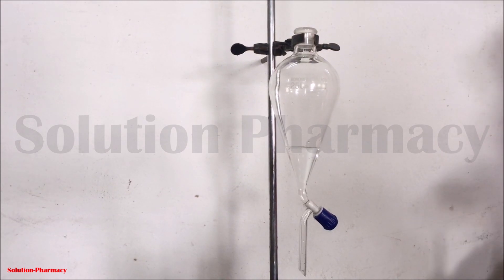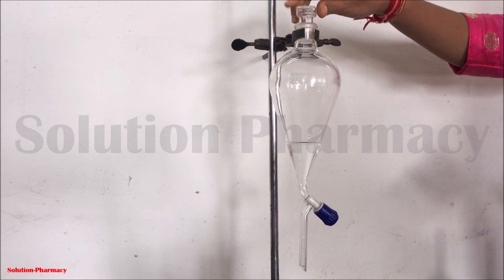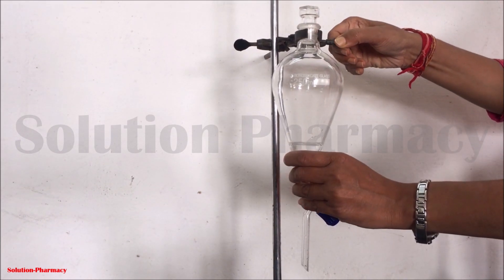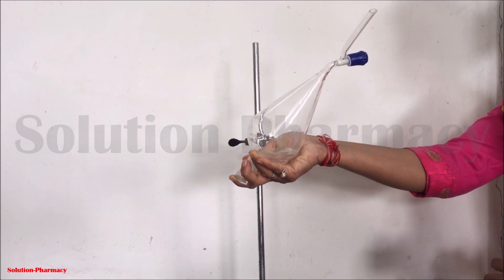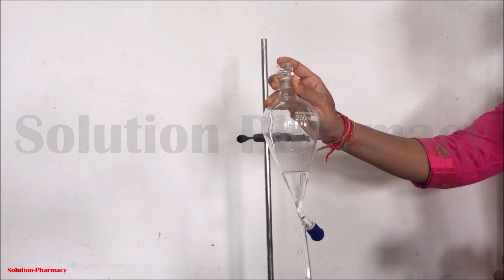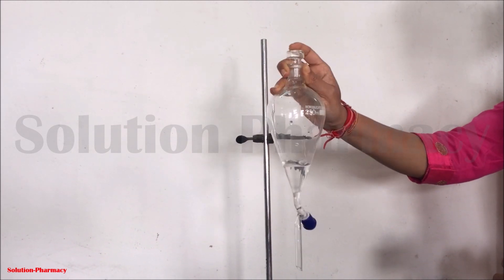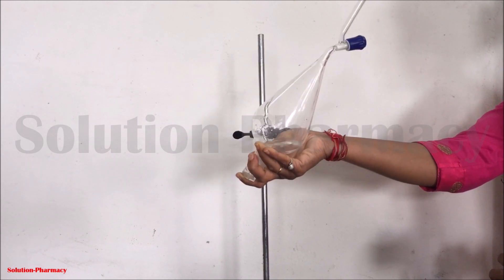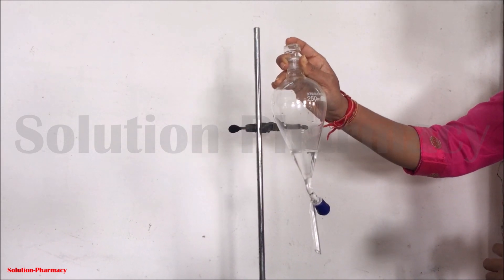After checking the stopcock, tightly close the separating funnel with the glass stopper and remove it from the clamp by rotating the screw. Press your finger over the stopper and invert the separating funnel to check for any leakage from the stopper side. Here you can see there is no leakage from the stopper side, meaning our separating funnel is now ready for the experiment.